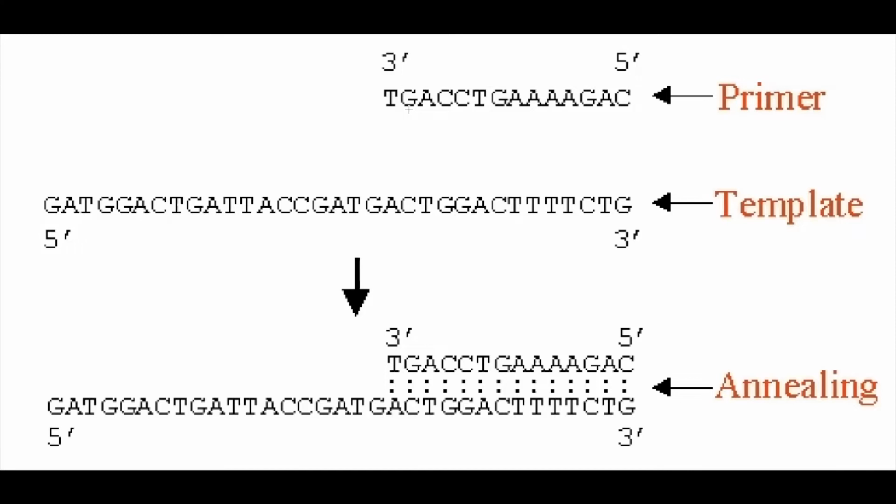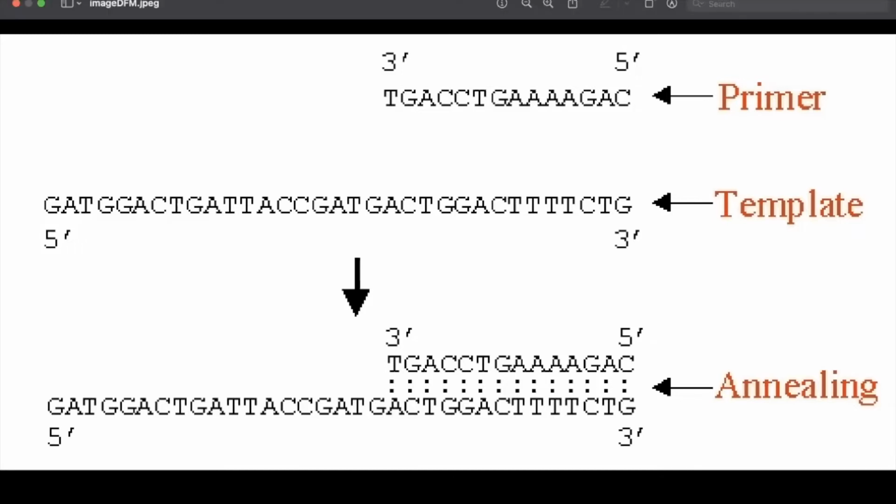Primer design usually incorporates the use of two types of primers, forward and reverse primer. During the denaturation step, two independent strands of DNA are released, wherein the forward primer binds to the template strand while the reverse primer binds to the complementary strand, amplifying both the strands. Rutvi will be showing how to design a primer, but it is important to know the design parameters first.